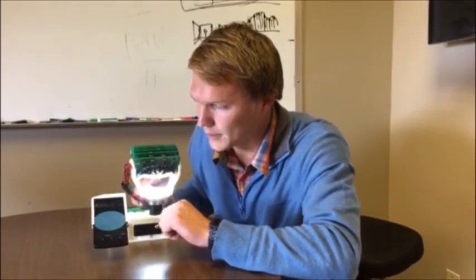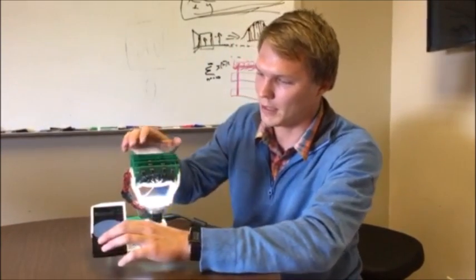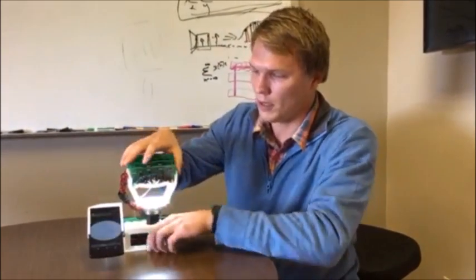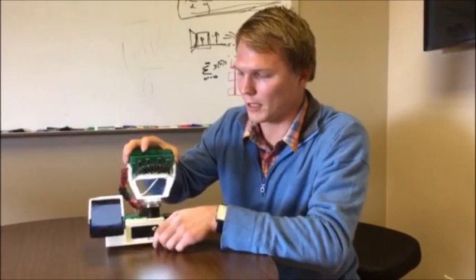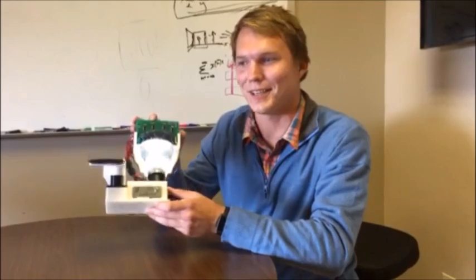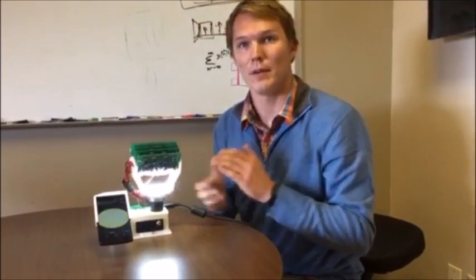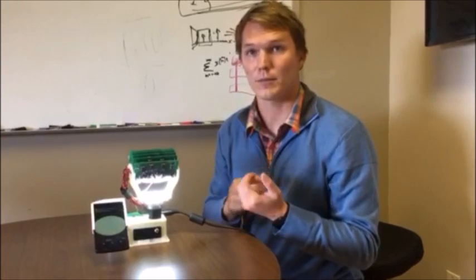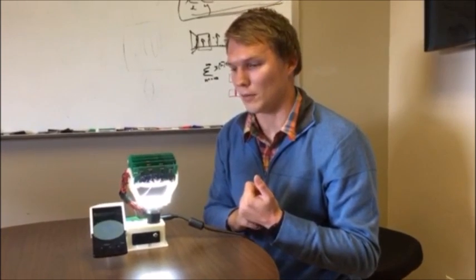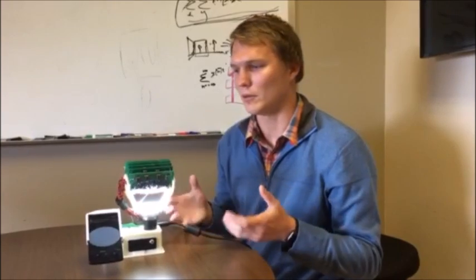There are several different ways we can program this, but basically, if we do this multi-contrast mode, we can cycle through different LED patterns and acquire different images. So you can kind of see the LED array changes there. And if we had a sample, you would see the sample in different ways every time. With this, you can get phase contrast, bright field, and dark field imaging, which is really advantageous because those are three separate microscopes, or at least mechanical inserts that we would use normally.